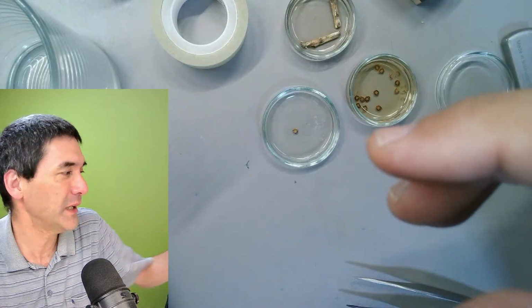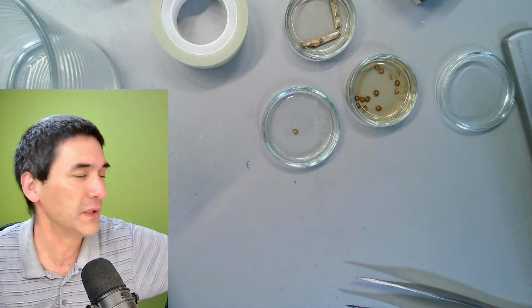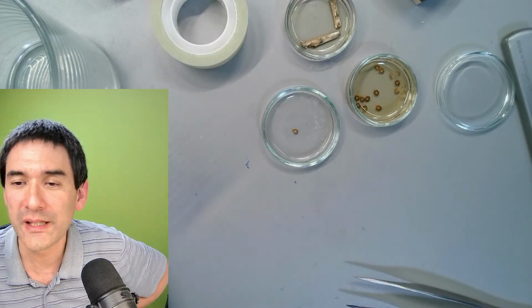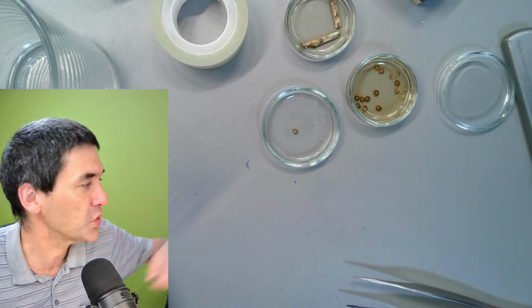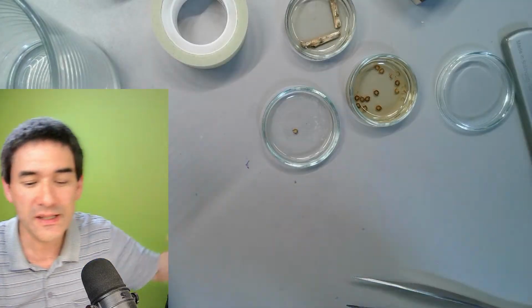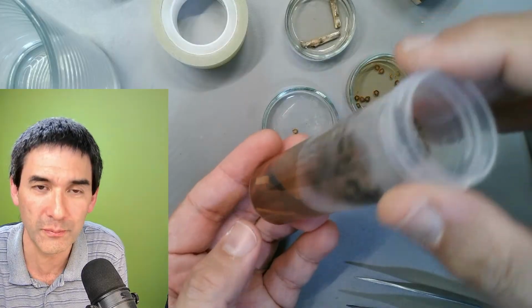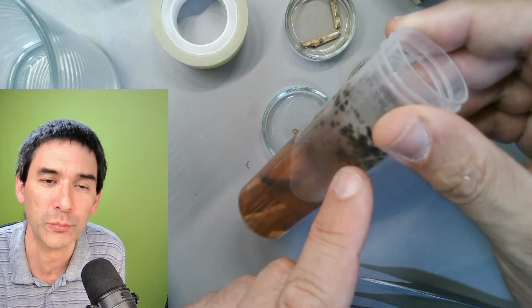So, okay, I'll put that back. But this was also a trial to get the wood soft. So the question is, did you boil the wood in pure glycerin or dilute it with water? Apparently a 1-to-1 ratio of glycerin and water works well. Yes, this here is a 1-to-1 ratio of glycerin and water. But I did not boil it. I simply kept it in the tube, and that's why it got moldy.